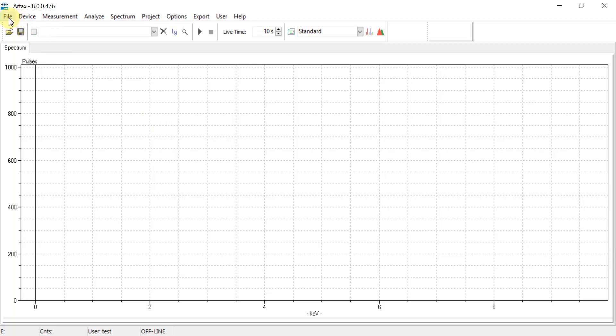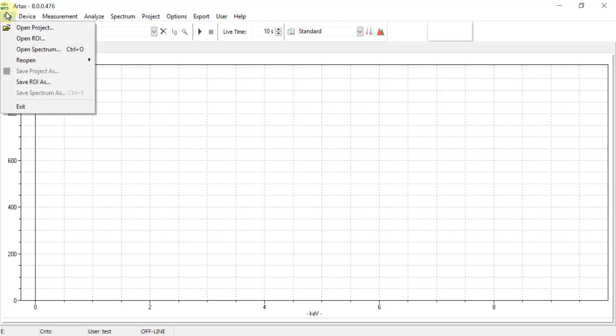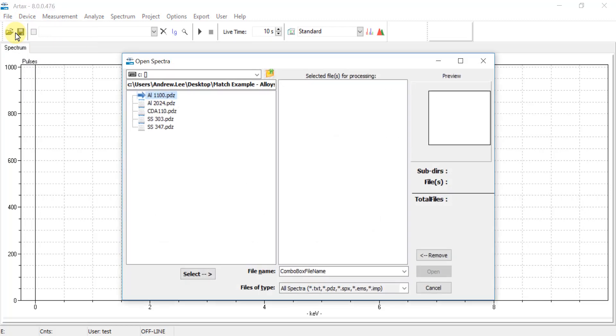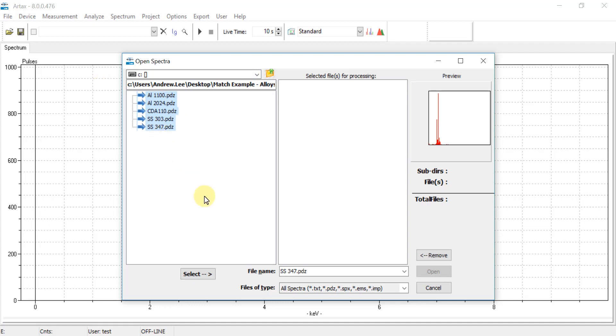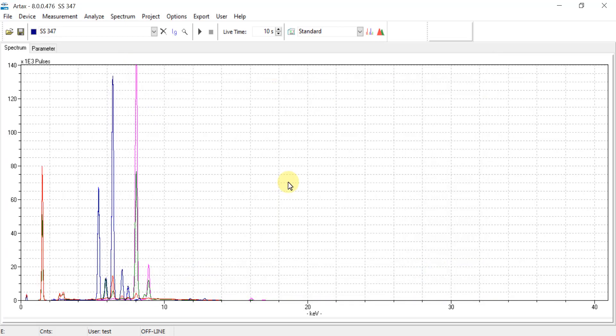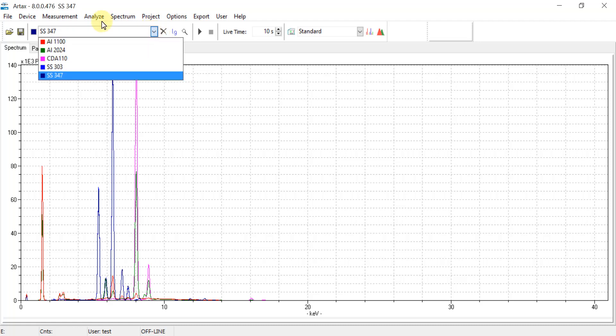So we go to the top menu and select File, Open Spectrum, and then navigate to the appropriate folder where the PDZ files are stored. Highlight the relevant ones, and then at the bottom hit Select and then Open. This will overlay all of those PDZ files together, and the dropdown list at the top will show their names and their color codes.